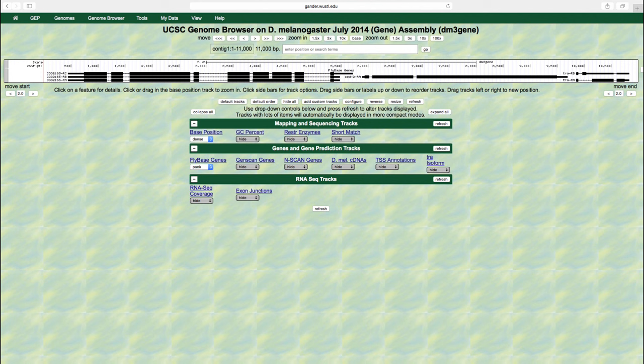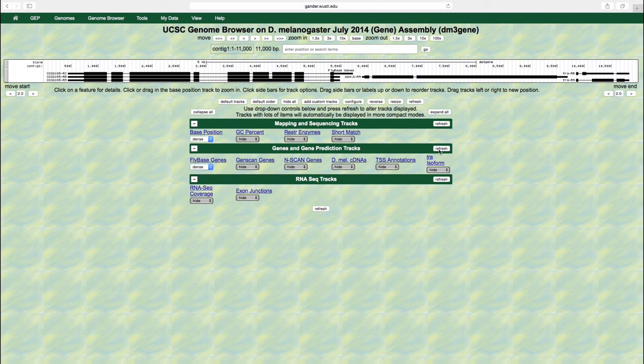For example, let's change the display mode for the fly-based genes track to dense and click refresh. The overlapping features are now rendered in a single line.